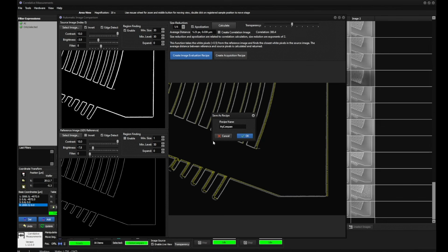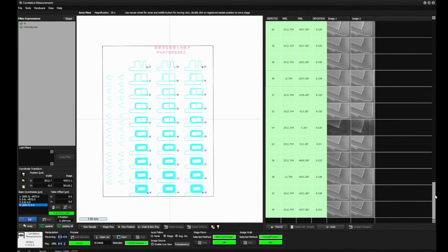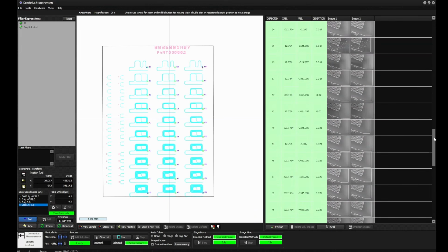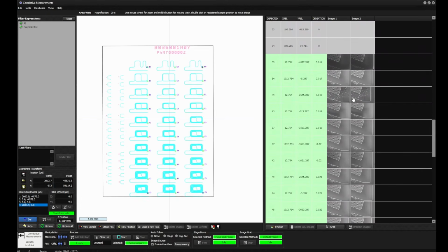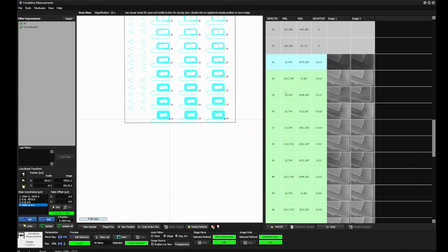We can just override our recipe by this demo compare and let it run again to see whether the values change dramatically. Okay, let's press start. We are finished. It has calculated all the deviations again, and we can see we have on this item now, where is this?